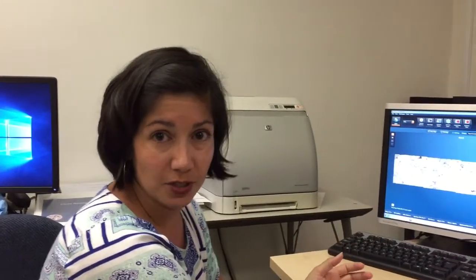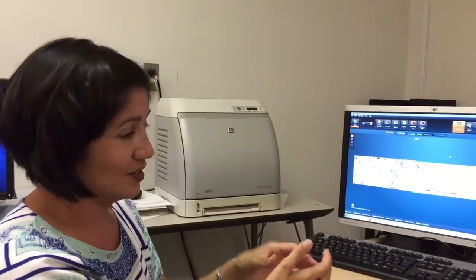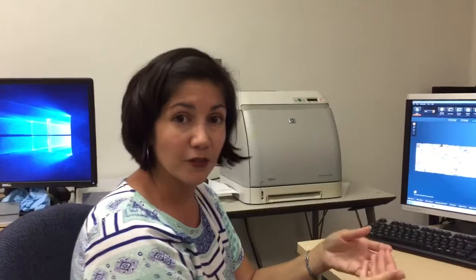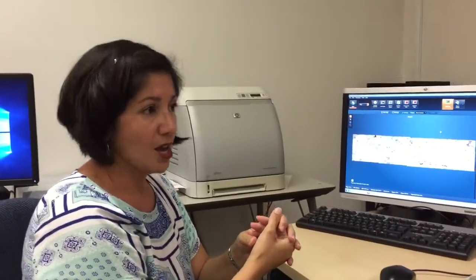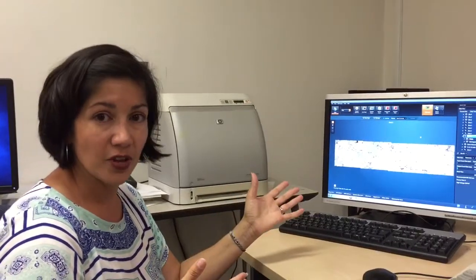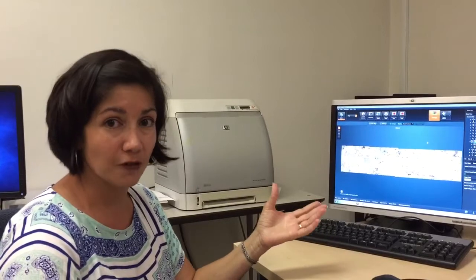Hi, we're back in the lab with a new sample now. We've got a piece of the lower crust from within a shear zone in Fiordland, New Zealand. This old piece of crust used to be a diorite and has then undergone many episodes of metamorphism and some deformation. Now we've taken a thin section of this sample from the shear zone and analyzed it on the SEM by a new technique, EBSD, electron backscatter diffraction.